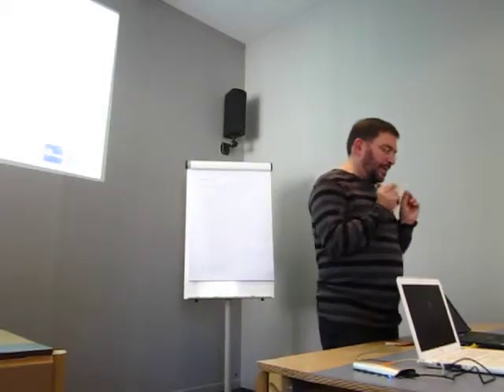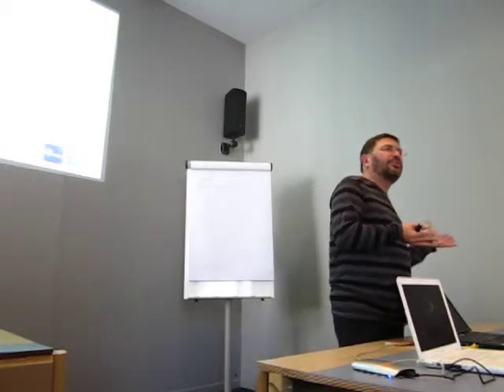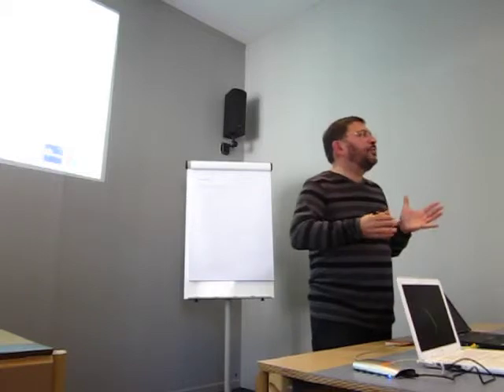If you put all the numbers together, I mean, you have a wavelength of 0.02 angstrom, and the resolution was 20 angstrom, 1,000 times worse. How horribly am I doing every possible step in the way?